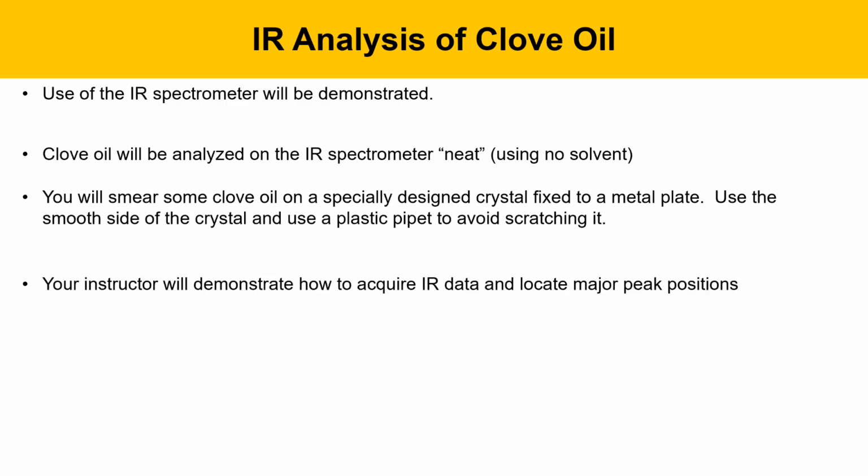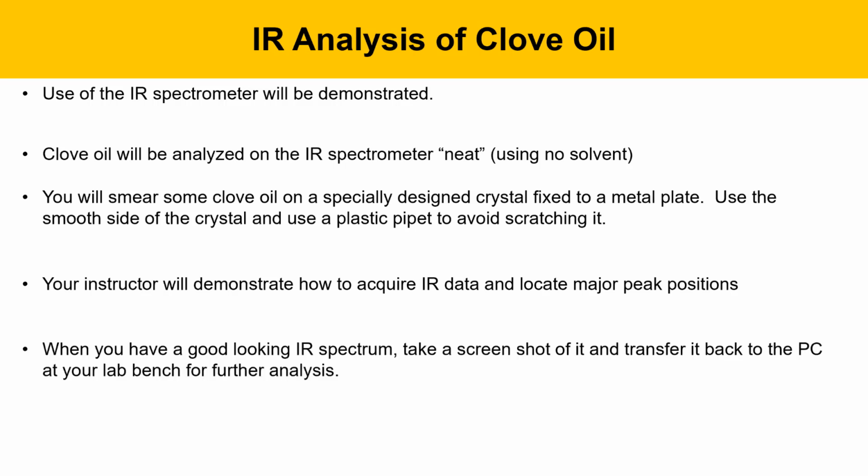Your instructor will demonstrate how to acquire the IR data and how to locate the major peaks in the software. And then when you have a good looking IR spectrum, you'll take a screenshot of that and transfer it back to your PC at your bench for further analysis.